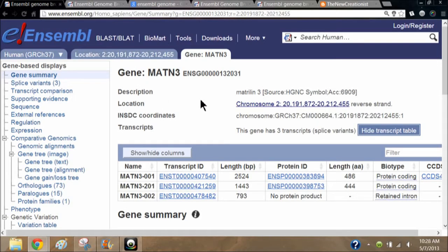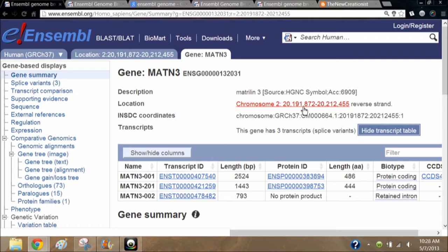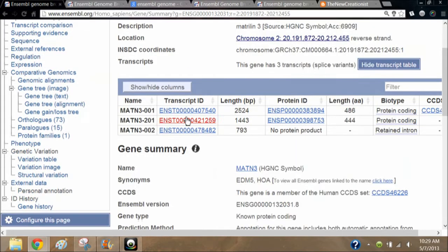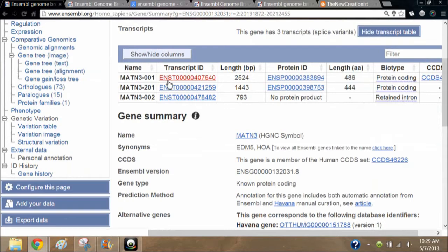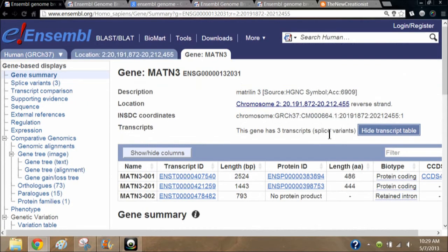Now we're on the gene summary page for Matrilin 3, which is a gene on chromosome 2, location 20 million 191 thousand 872 through 20 million 212 thousand 455. It's going to give you a list of the transcripts. This gene has three transcripts, and what we're going to do is look at the orthologues.